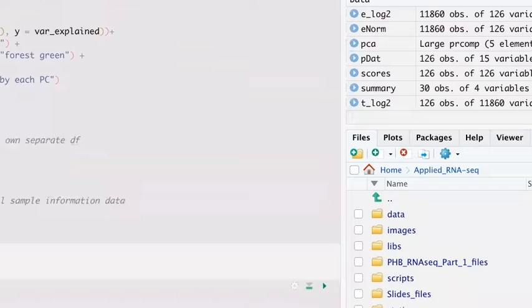And now we have these two data frames called EDAT and PDAT, so our expression data frame and a phenotypic data frame. There's another type of data frame that I use, or that I've been taught to use, which is called the metadata frame. Metadata is basically all of your data, which is how I think about it, which is not just your clinical data. Now, this PC data that we got is not phenotypic or clinical data, but it is data that we want to attach to our samples. So we store that in a data frame called MDAT.